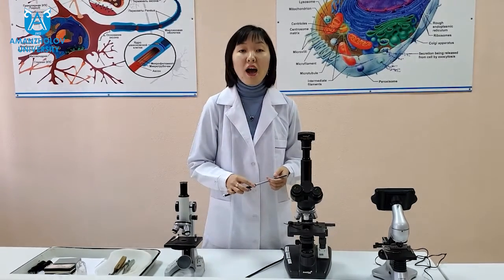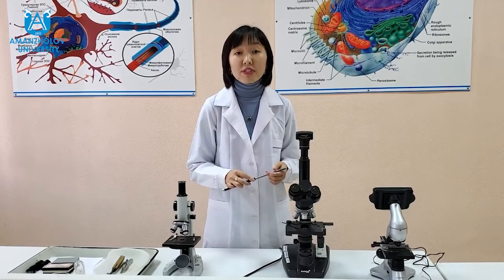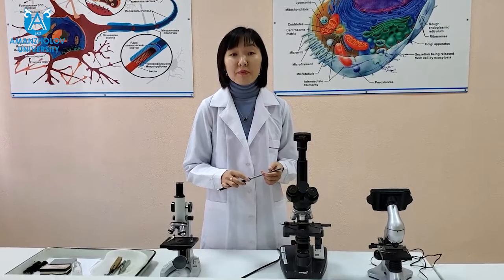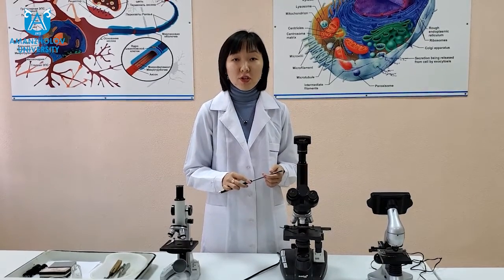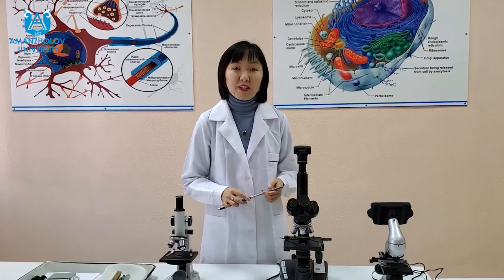The attachment point for replaceable attachments: visual, photographic, television, various transmission devices. A purely mechanical unit of the microscope is a stage designed to fix the object of observation in an obtained position. The second, optical part.